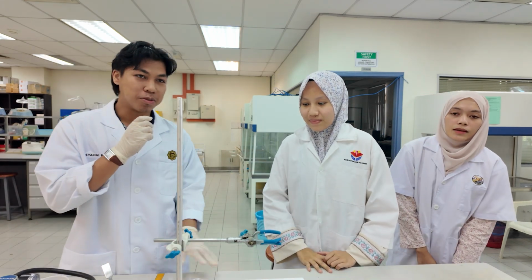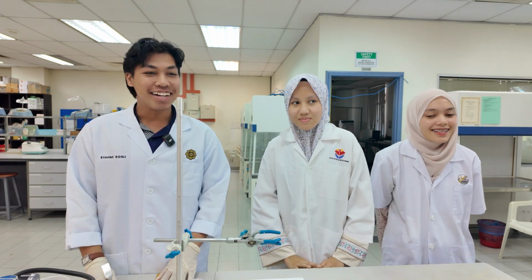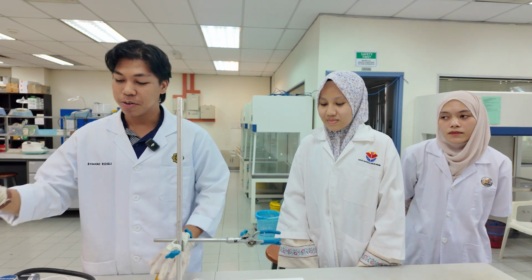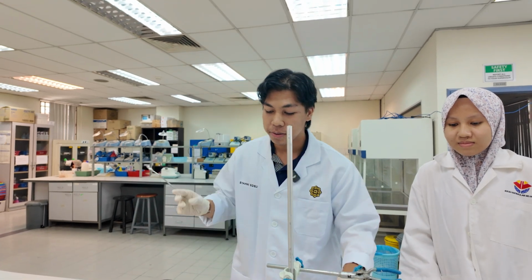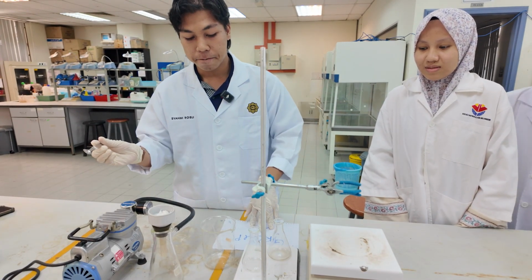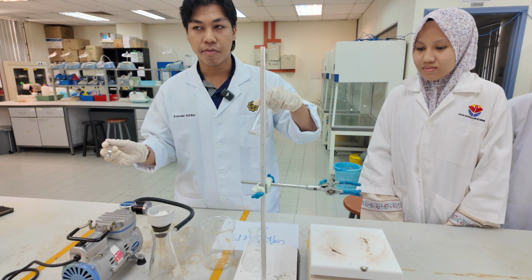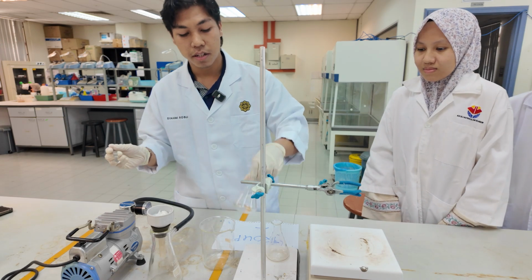Okay, Assalamualaikum warahmatullahi wabarakatuh. How are you guys today? Today I will run the experiment here. As you can see here, we have a vacuum, conical flask, beaker, and heating plate. First of all, we have here the single flask and the mixture flask.